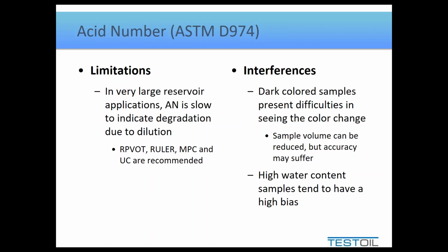The other interference with this test is to do with water content. Basically, if a sample contains high water content, what will happen is during the test, more acids will form.